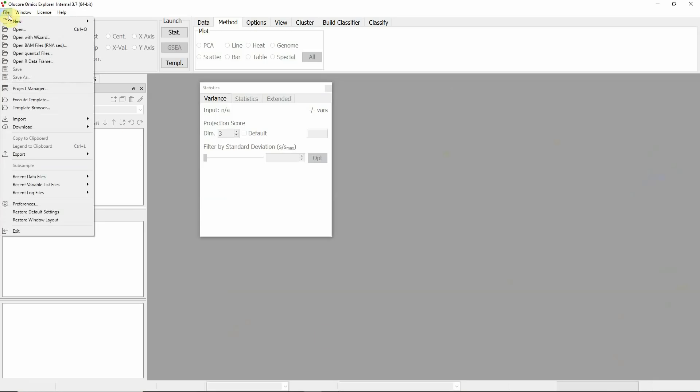In addition to the BAM files from the experiment, a matching GTF file is required. Other available options are to import so-called quant.sf files or to import a raw count matrix with the wizard.